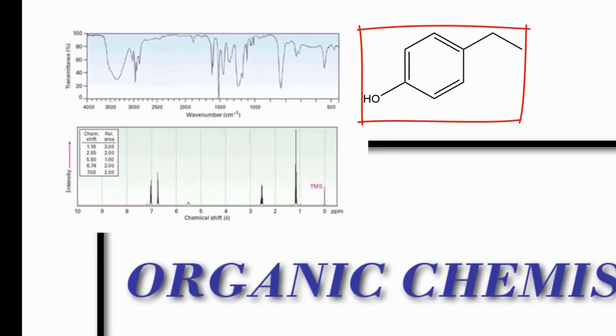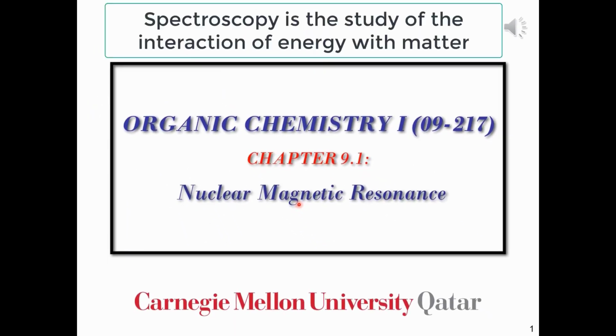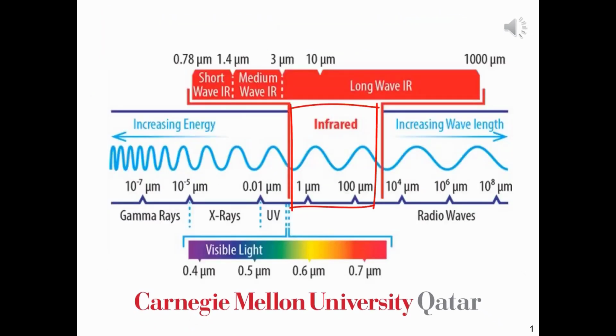Remember, spectroscopy itself is the study of the interaction of energy with matter. Last time we looked at infrared radiation, and this time we'll be looking at radio frequency radiation, or commonly known as radio waves. These have a lower energy than the corresponding infrared radiation.